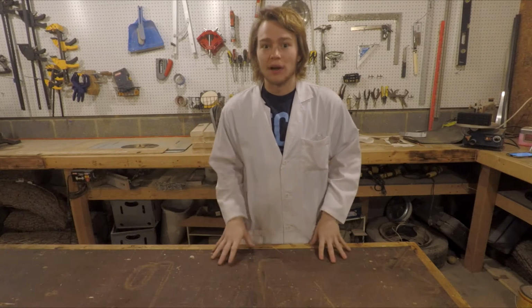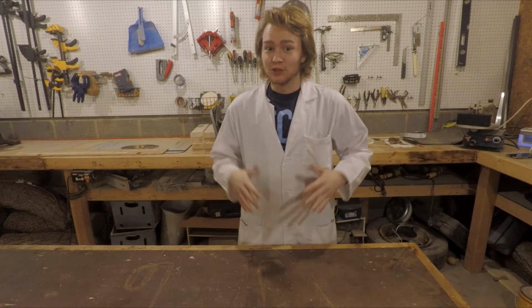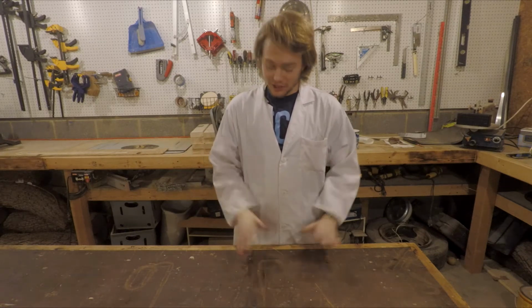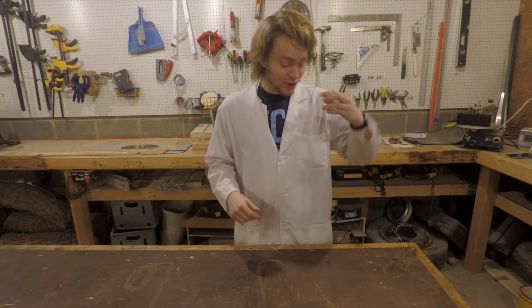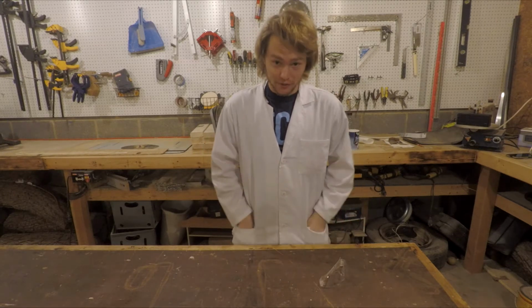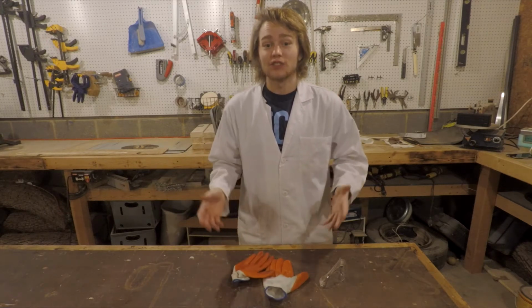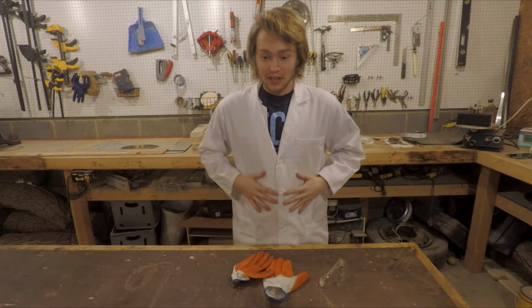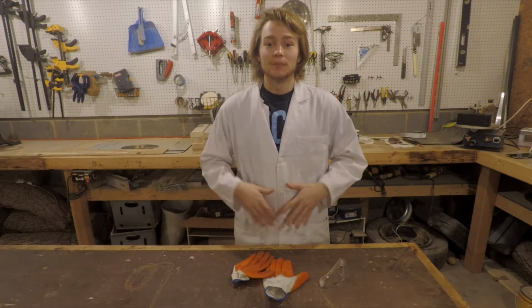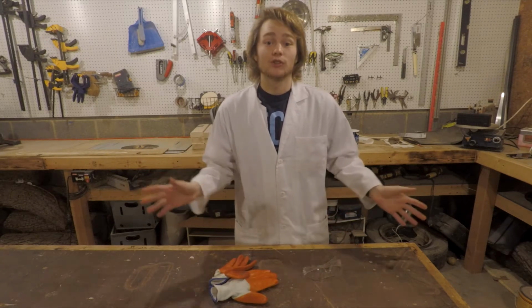So today we're going to be doing some chemical reactions, and to take some safety precautions before we do this, you'll notice I am wearing a lab coat just to protect my clothing. I also have a pair of safety glasses, which you'll definitely need, and also some rubber gloves. The reason I have these is just to protect my body. I don't want anything to damage my skin or my eyes or my clothes. If you are doing this, make sure you have these. You don't want anything bad to happen to yourself or the space around you.